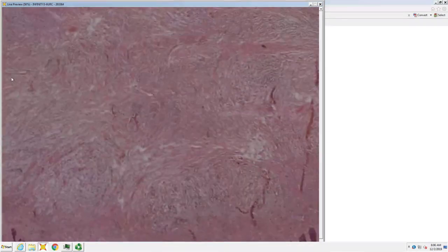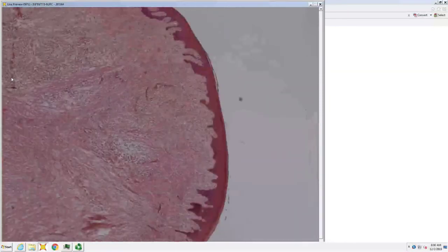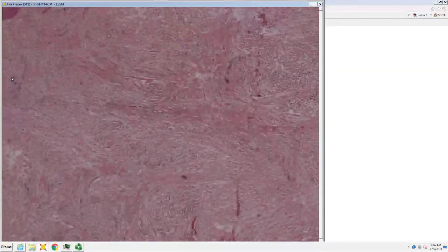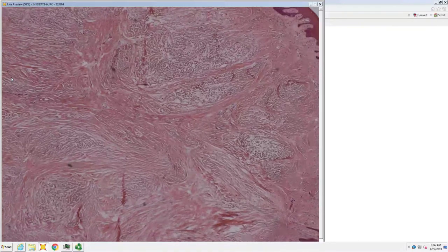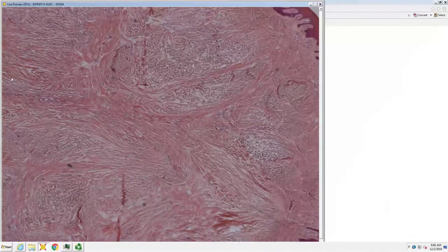Okay. We're in a mouth, and it's kind of keratotic for a mouth, probably because there's been a lot of friction, and you have these fascicles of collagen. If you get that kind of pattern on an upper back, you have a nuchal type fibroma. If you get this in the mouth, it's a submucosal fibroma. Very similar crisscross pattern of mature collagen.